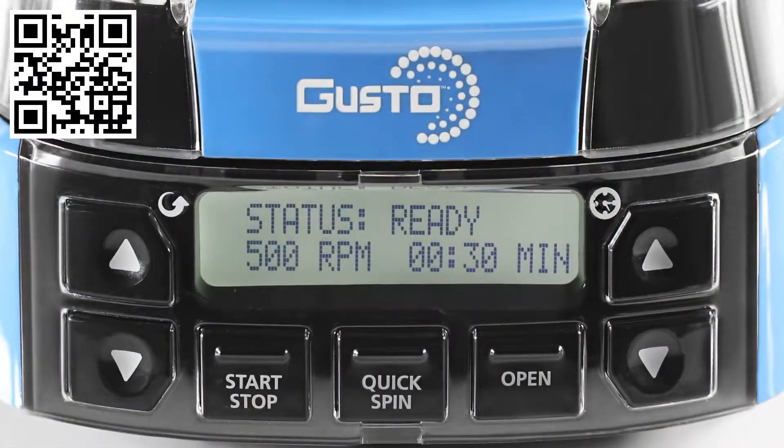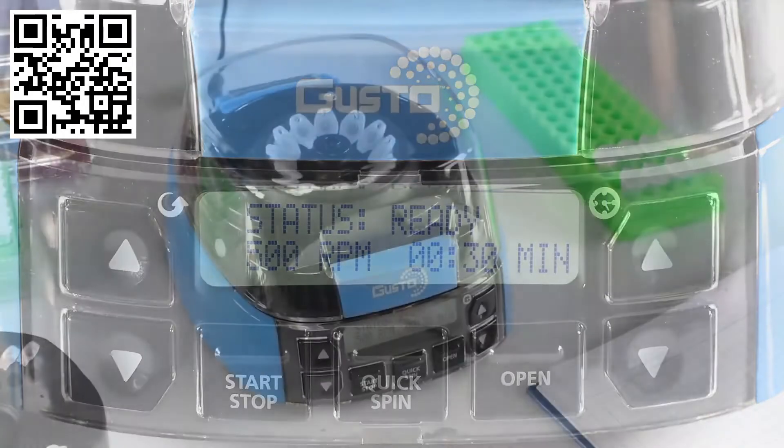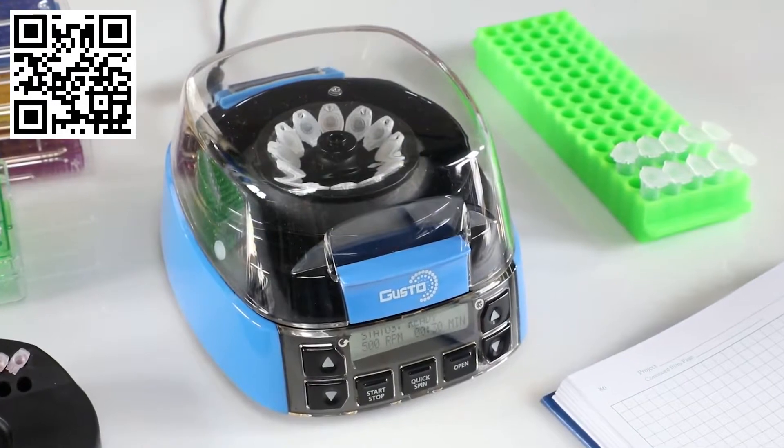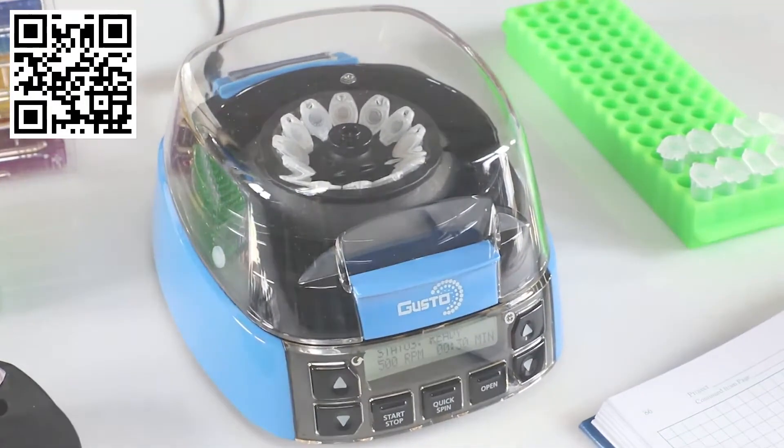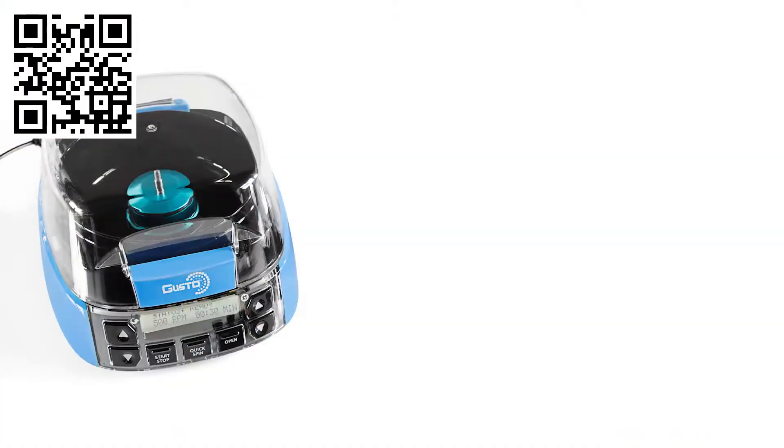Equally beneficial is the backlit display, which conveniently shows all time, speed, and operational information on the same screen. The unit's UV-resistant plastic helps facilitate durability and a longer life under harsh light conditions.